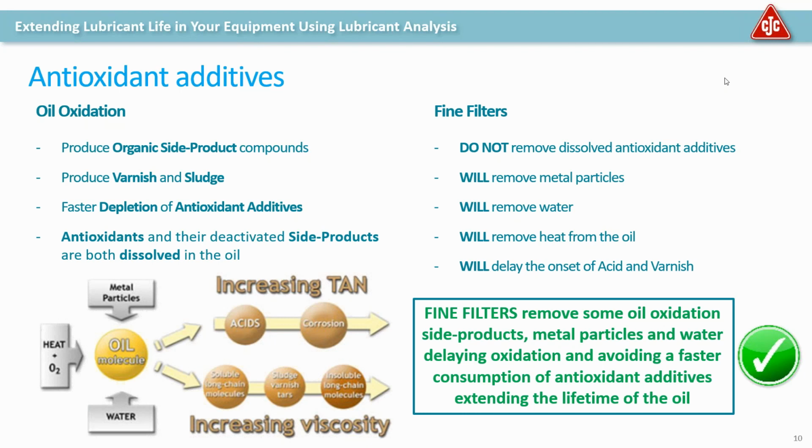But I think, so we definitely know that monitoring lubricants using specific tests will help us understand how we're doing with the lubricant. But something that always comes into play with extending the lubricant life is we know we are going to run into problems at times. It does happen. So once we encounter a problem, such as high acid number or water ingression, can we still work towards extending the life of that lubricant?